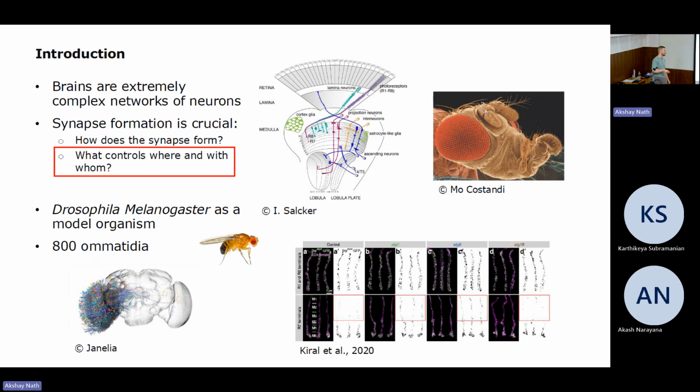This is what we would expect. But if we take a look at the mutation ATG7, you can see that quite a few more synapses are located in this upper part. So what does this mean? We know that DM8 or DM9 are located around here, and we can detect some synapses here. This means that in case of this mutation, this cell must be connecting to another cell up here. So our goal is to detect which types of mutation actually cause this behavior, for the cells to connect with cells which are not their typical synaptic partners.